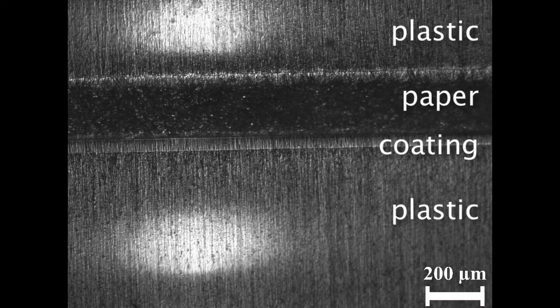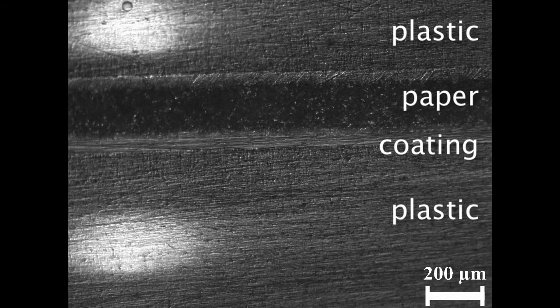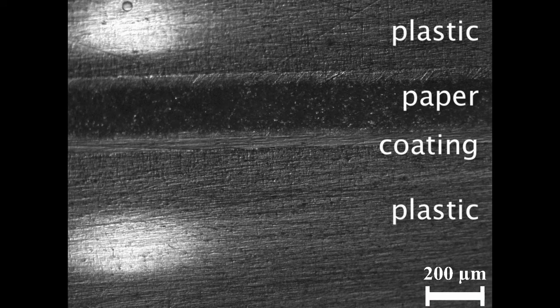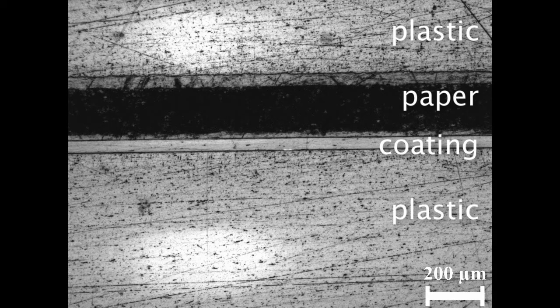Here you can see the microscope images again. This is the six micrometer grade, and here comes the three micrometer grade, followed by the final one micrometer grade.